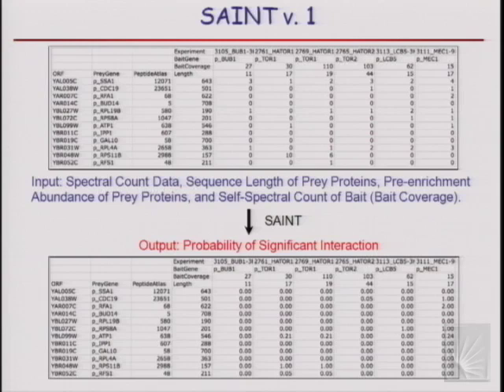Another difference between us and Mike's method is that our numbers can each be one, because we do not require that the probabilities sum to one. Mike's method assumes that all probabilities for each prey should sum up to one. We can discuss that offline later.